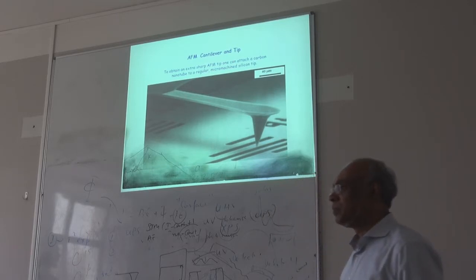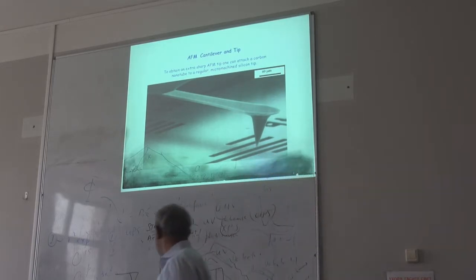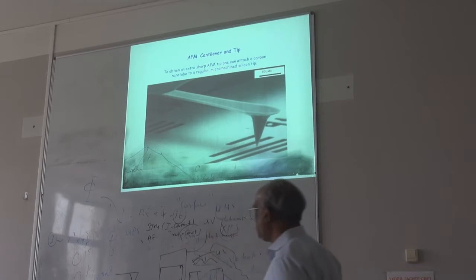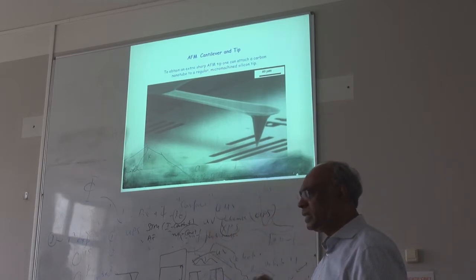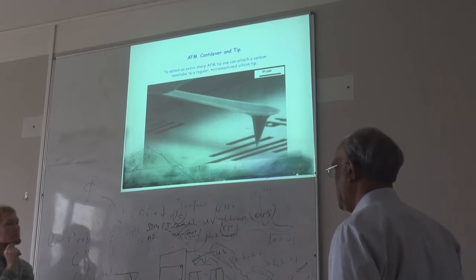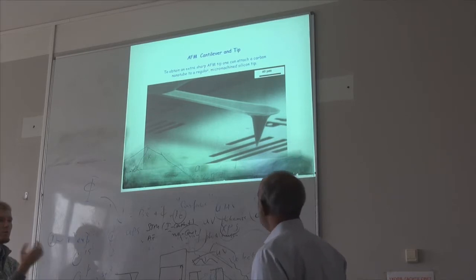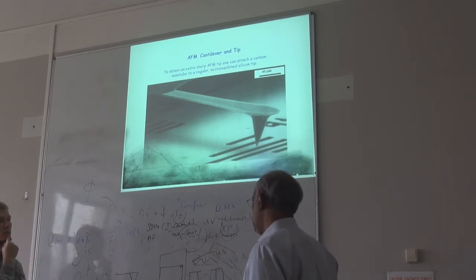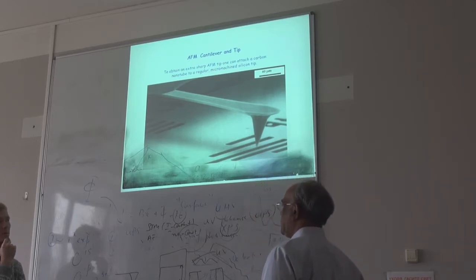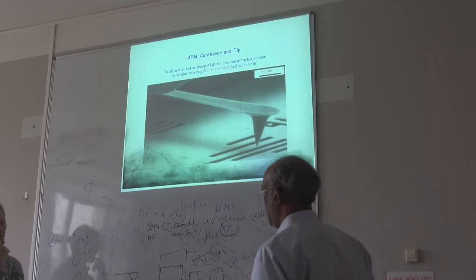If you use nanotubes, resolution is higher. Oh yes. If you use this one, your resolution will be better compared with ours. I think if you want to look at things like DNA molecules, they like to use this technique. They use much finer ones. But I don't see any need for my research. What about the resolution of the translational stage? Oh, that you can control at maybe the sub-micrometer scale easily. Is it a piezo? Yes, they are all piezo.